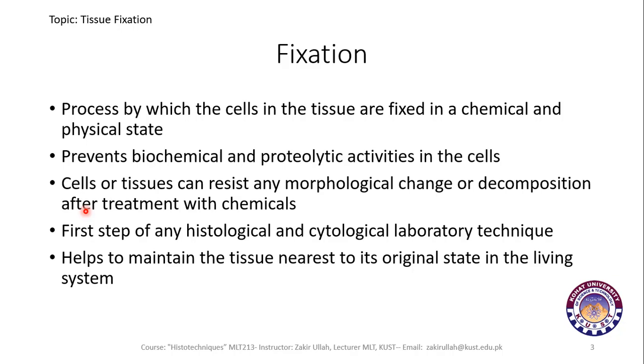And the basic purpose, the basic aim of fixation is to maintain the tissue nearest to its original state in the living system. Just like, for example, if a muscle is removed from the living body, to maintain that muscle just as in the living body, we have to fix that muscle.